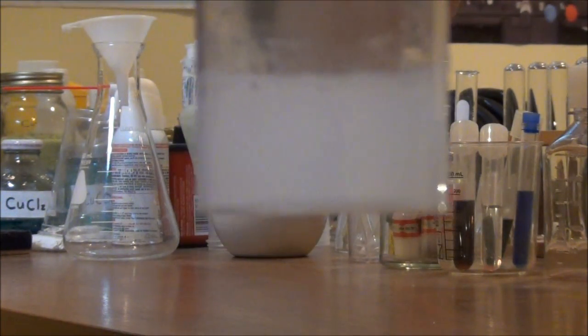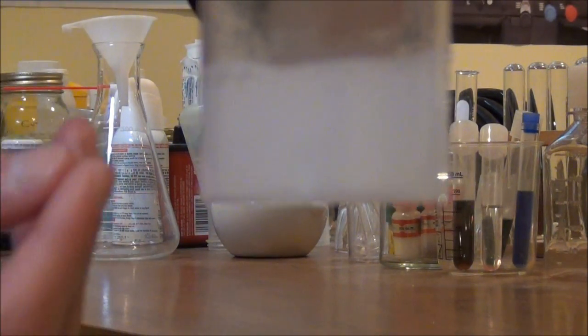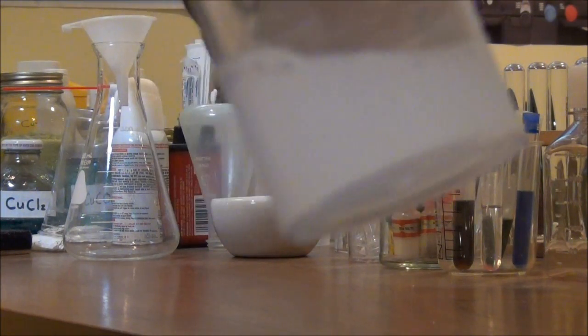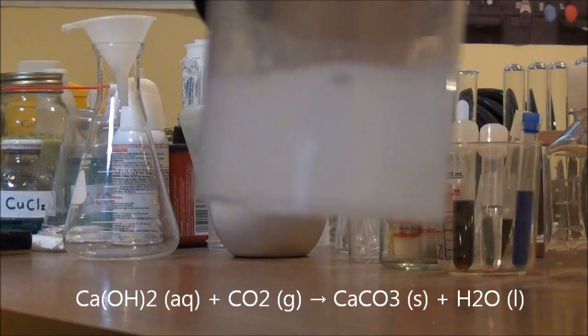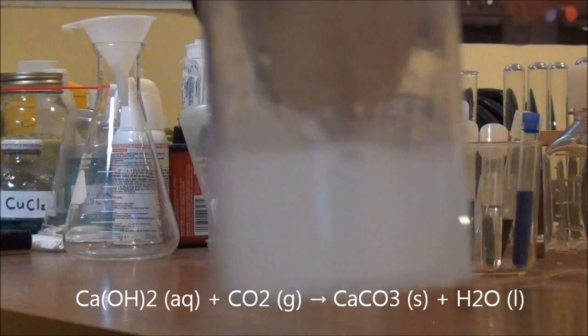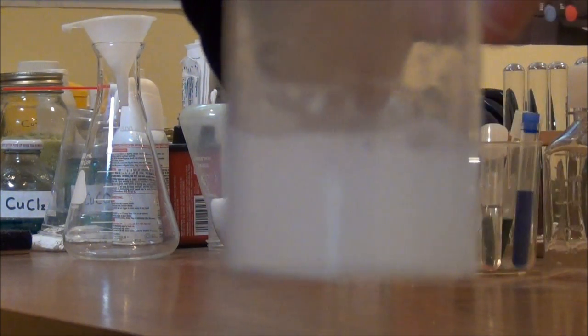That's because the carbon dioxide from my breath has reacted with the calcium hydroxide that was in the solution to form a precipitate — this kind of milky, cloudy, white precipitate of calcium carbonate, which is the same material that chalk is made of. So now a solution that was initially almost clear has turned almost completely opaque because of this white precipitate of calcium carbonate.